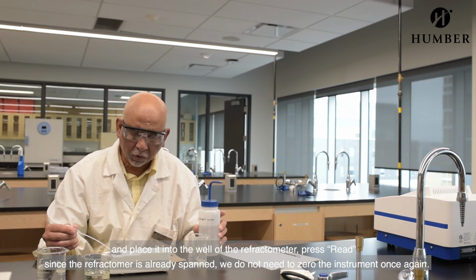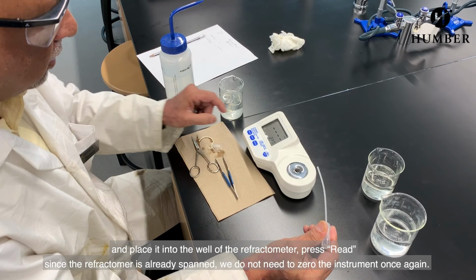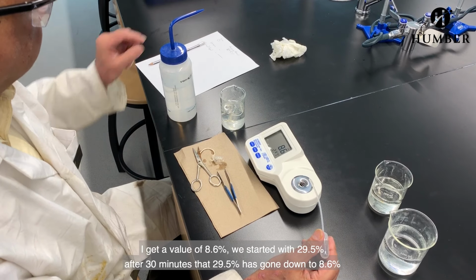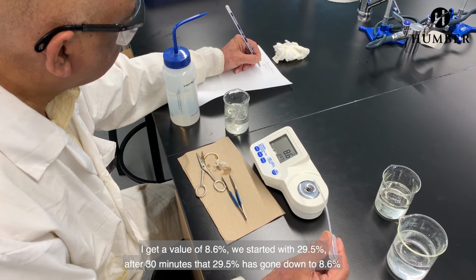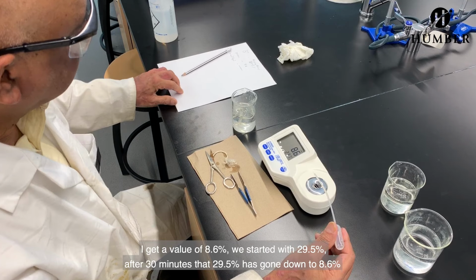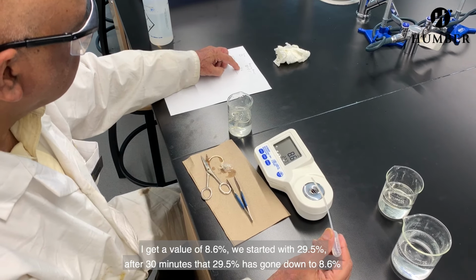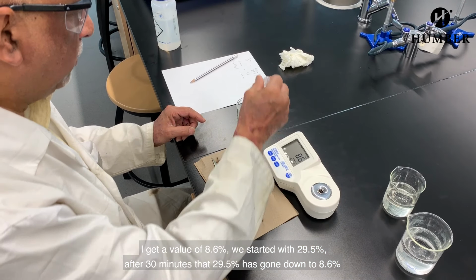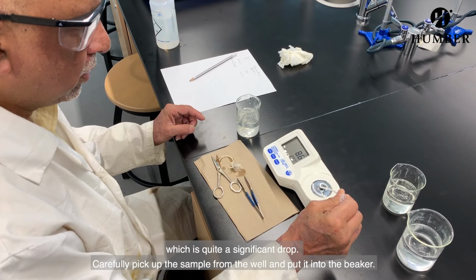Since we have already spanned this equipment, we won't need to span it again. We're just going to press read, and I get a value of 8.6. So let's have a look. We started with 29.5. After 30 minutes, that 29.5 has gone down to 8.6, which is quite a significant drop.